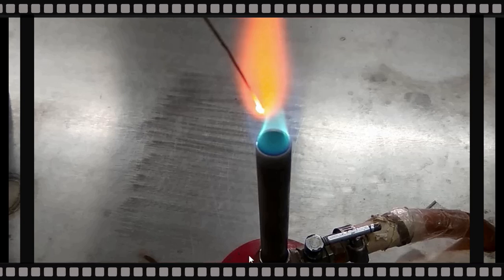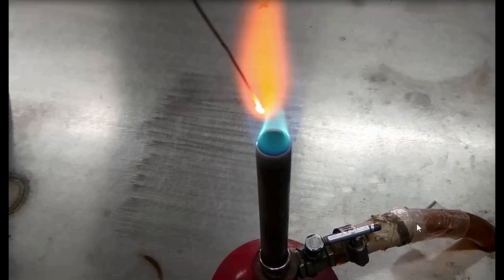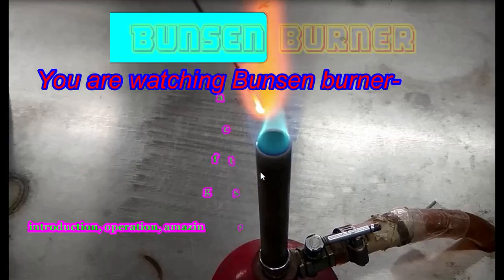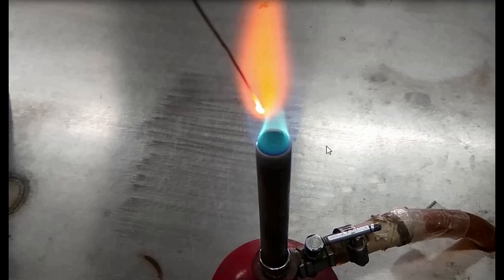This one is the gas inlet. Needle valve for gas flow adjustment, this one is the needle valve. And the final one is the rotary barrel, this one for air adjustment.